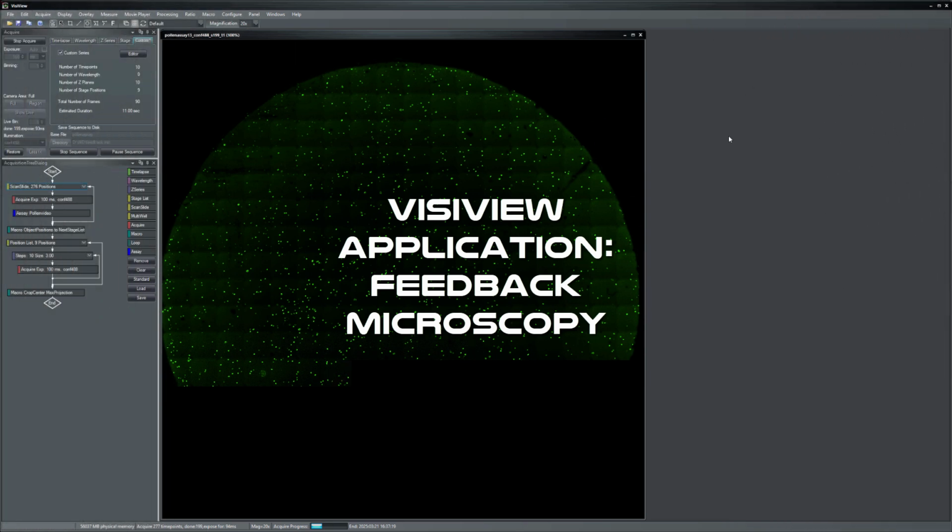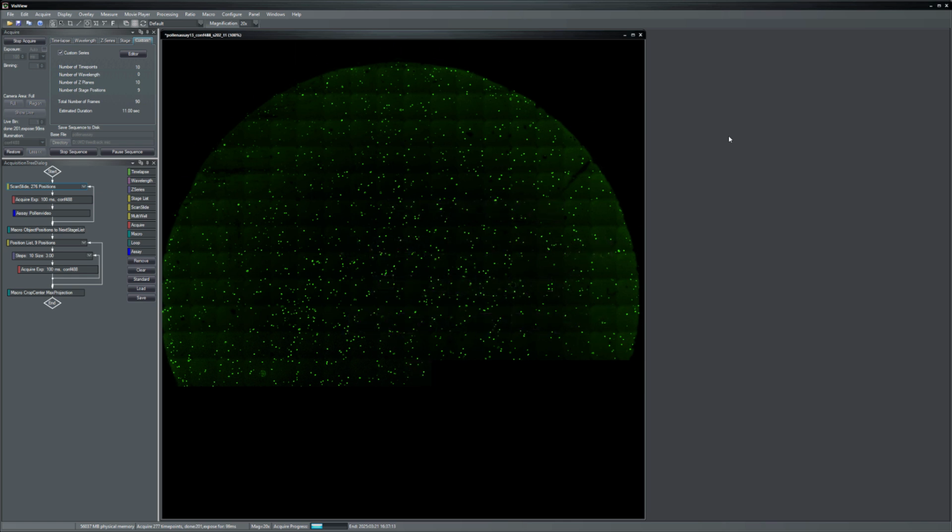Welcome to the VisiView feedback microscopy application video. You may have already seen the potential of the custom acquisition editor to easily set up complex experiments.